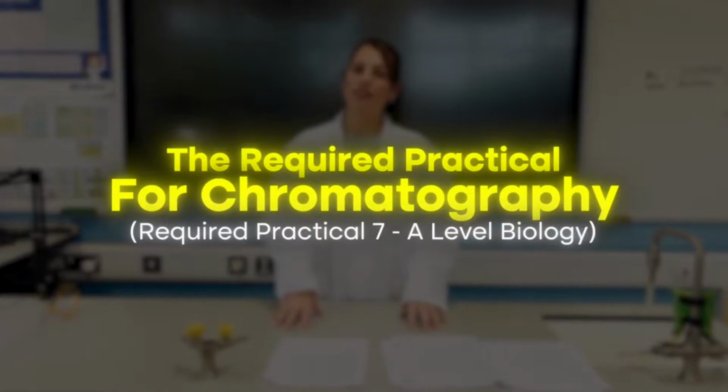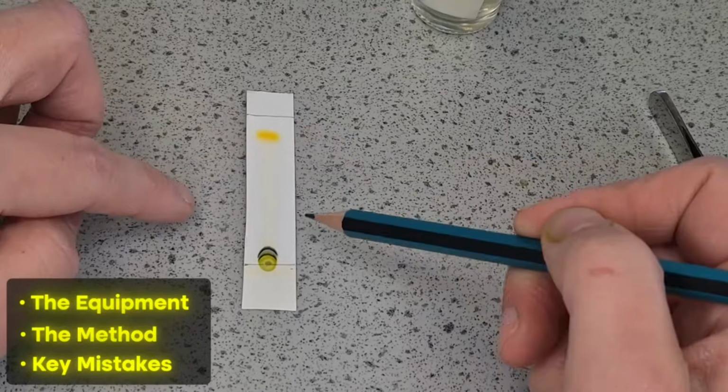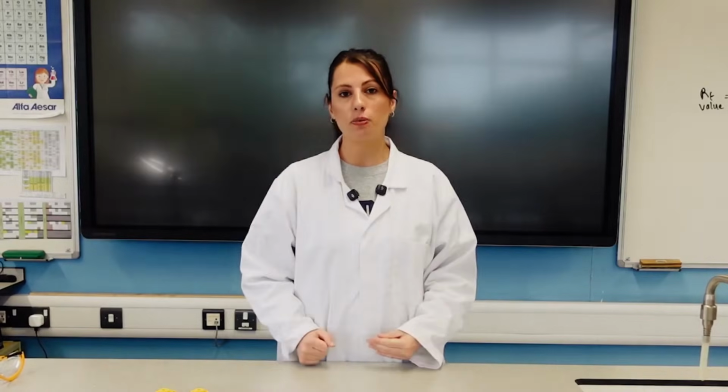In this video, I'm going to go through with you the required practical for chromatography, Required Practical 7, A-Level Biology, and I'm going to be doing it with TLC paper. So I'm going to go through with you the equipment, the method, key mistakes students might make for you to look for, but also emphasizing what are the common exam questions that come up linked to this, so you can make your students aware of that as well.